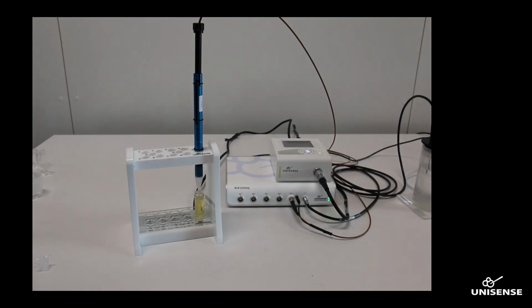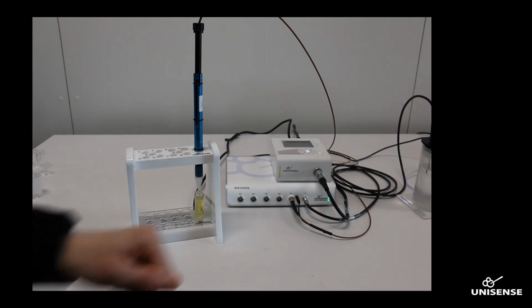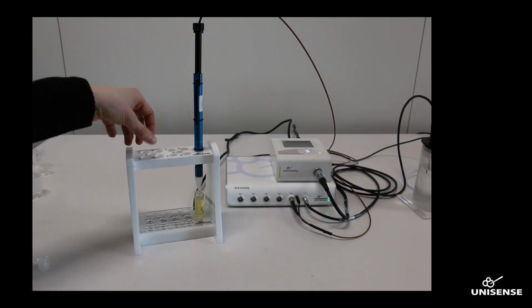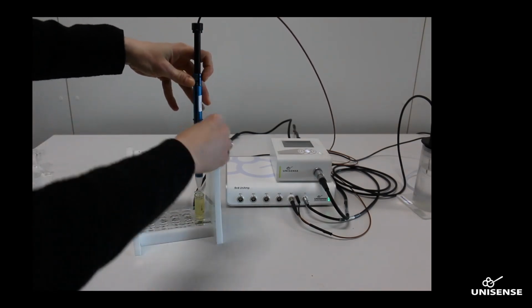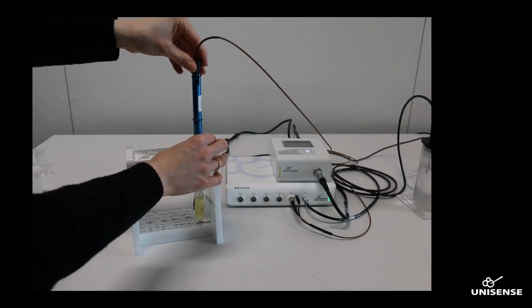This means that we can now measure 0 point, so no oxygen, but we do it in water. So the water inside the silicone tube has no oxygen, and this allows us to directly afterwards move the sensor into our samples without having to rinse the sensor tip. So this is quite neat. So I will just put the sensor tip into the chamber here.